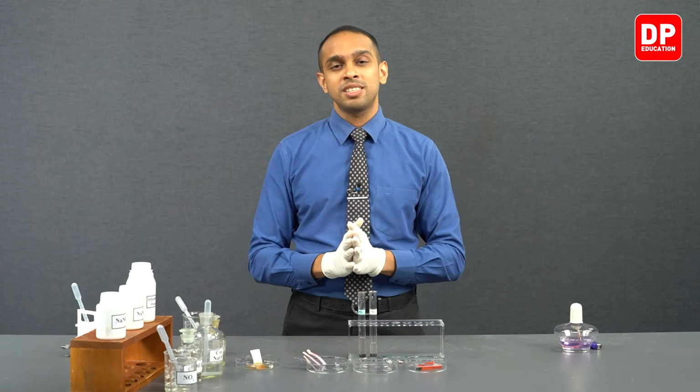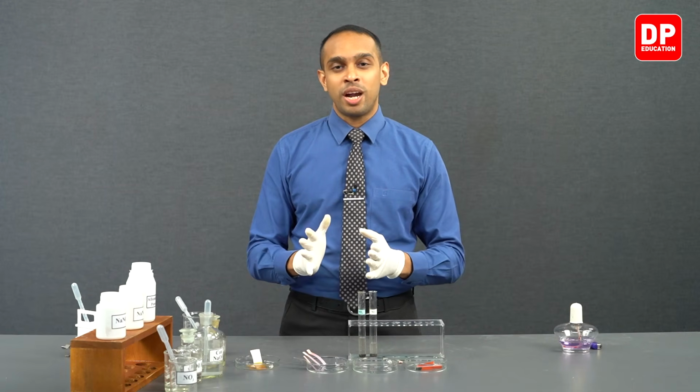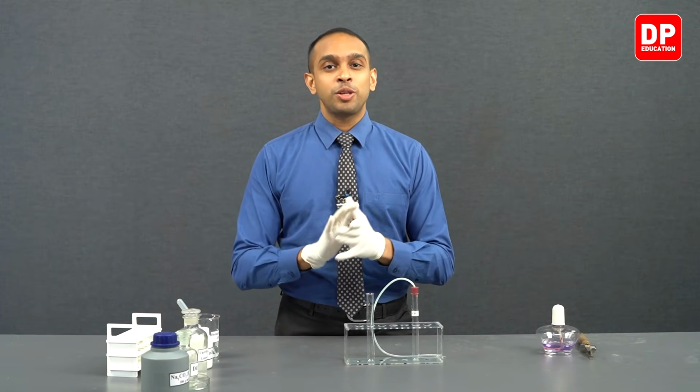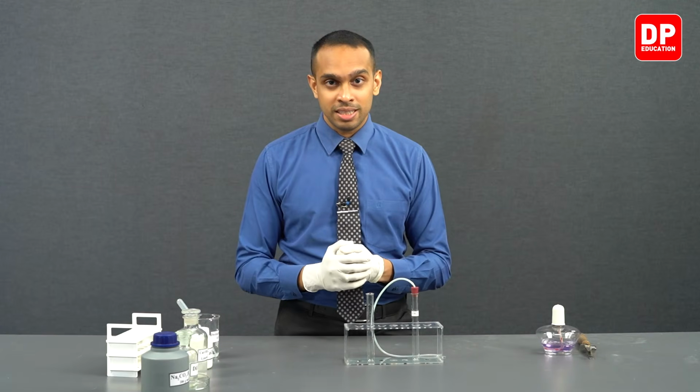So these are the tests that you can do to identify nitrate and nitrite ions. Let's move on to identifying carbonate ions. Now students, we are going to observe the identification test that we can do for carbonate ions.